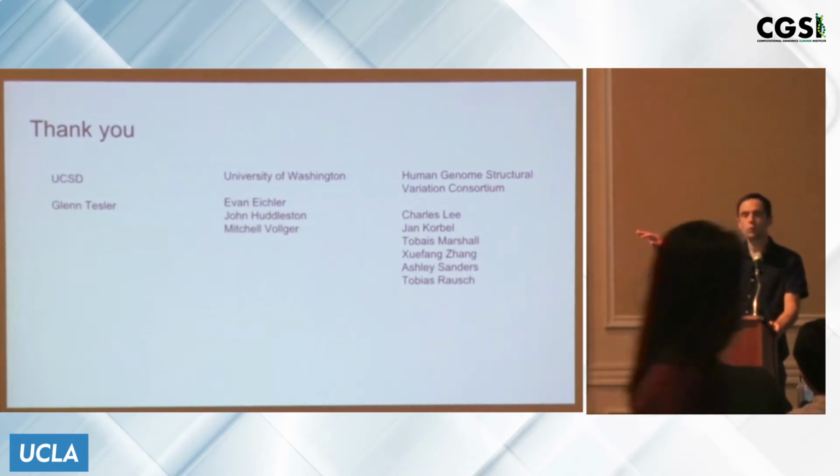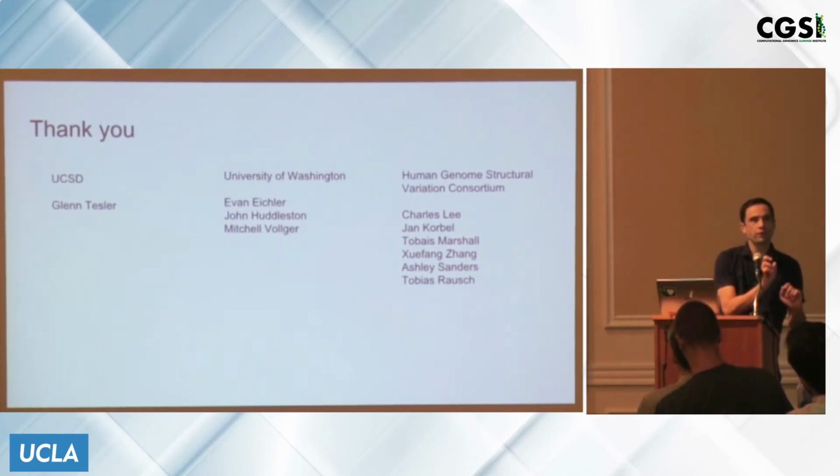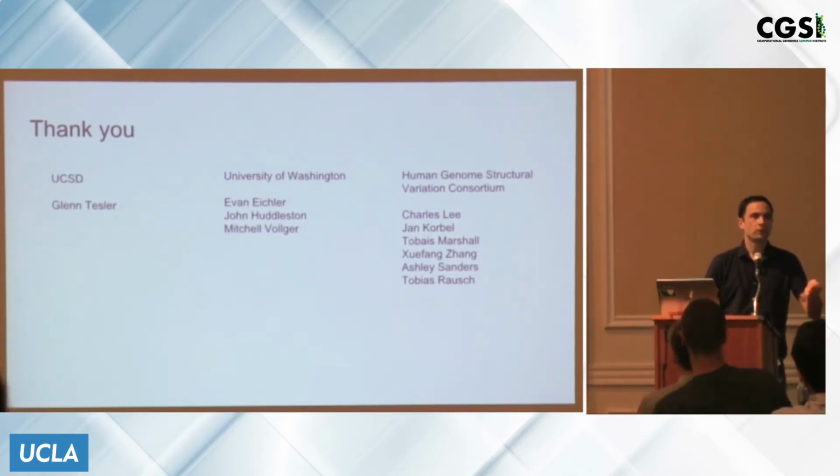Yeah, so the main way that technologies were combined in the HGSVC was essentially to do phasing and then variant calling. For all of the regions where there were pretty small variants in the PacBio data, where it would have been pretty difficult to tease out the different haplotype structures, phasing and partitioning lets you have better resolution. We didn't really combine the Illumina SV calls with the PacBio SV calls. We just made a merged set altogether.